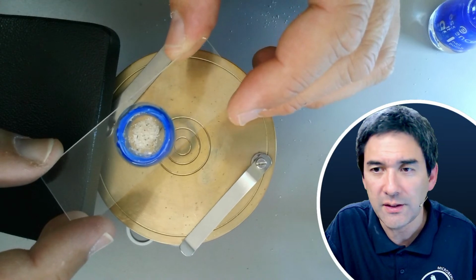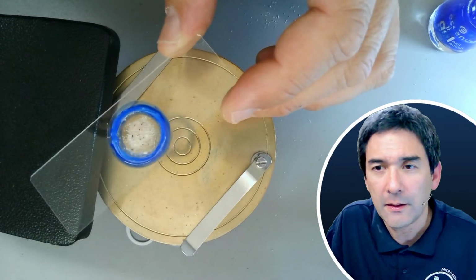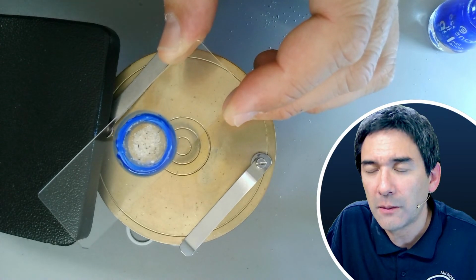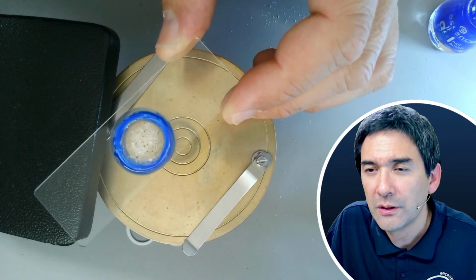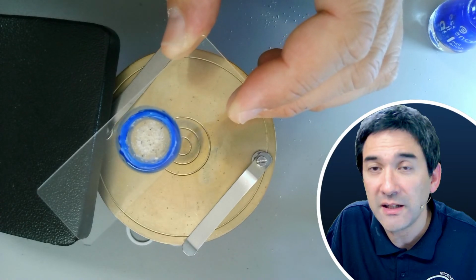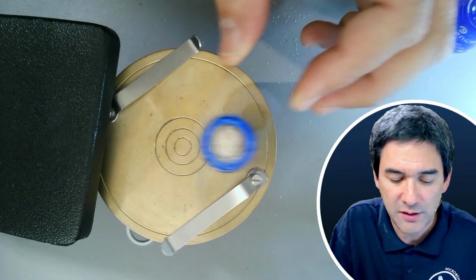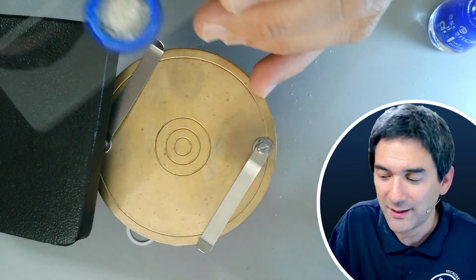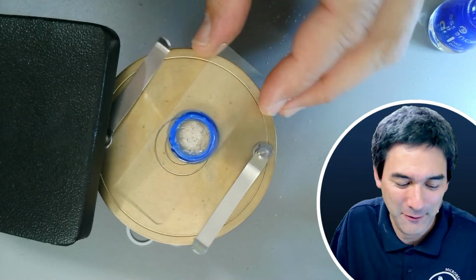And let's have a look at this. Okay, so there are a couple of questions here. Can you use dark? Yes. Are there any other choices besides nail polish? Yeah, sure. You know what this is here? This clear, are you able to see this here? You're gonna laugh now.